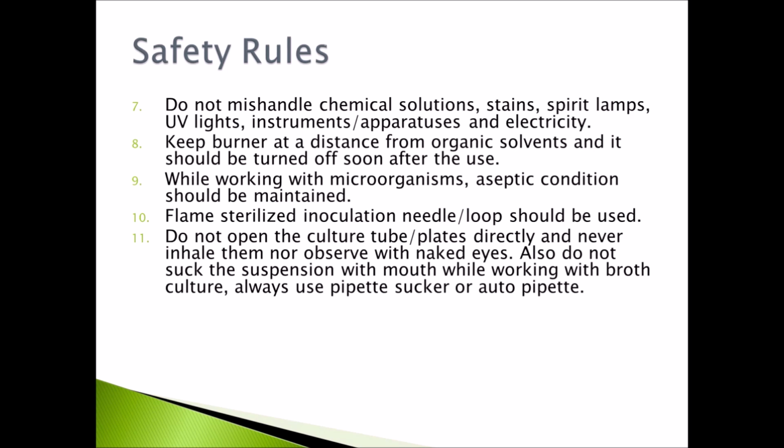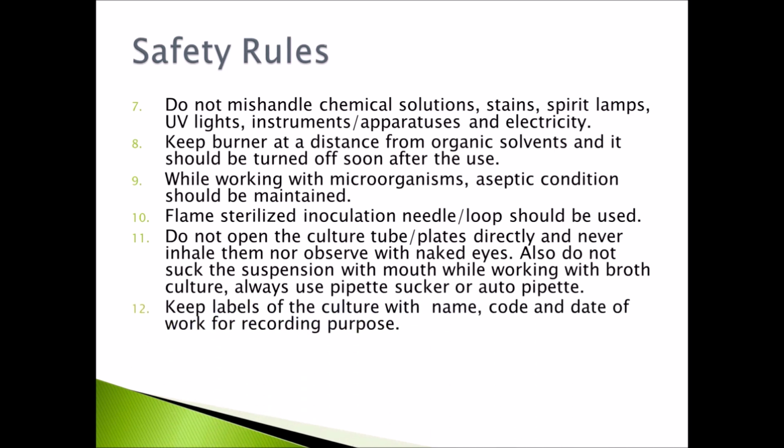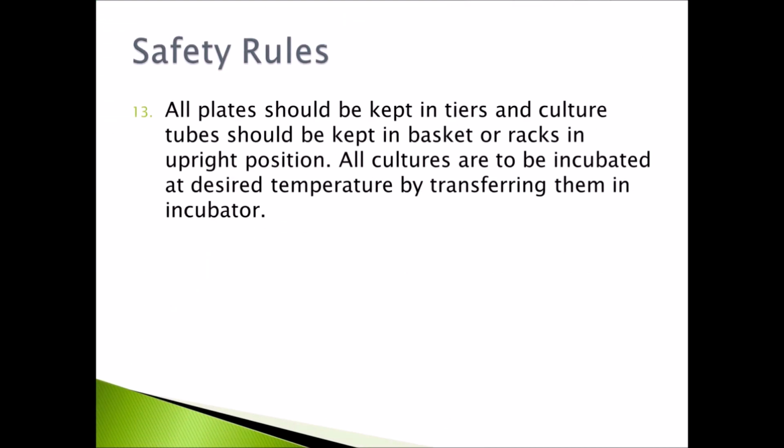Always use a pipette sucker or autopipette. Keep labels on the cultures with name, code, and date of work for recording purposes. All plates should be kept in trays and culture tubes should be kept in baskets or racks in an upright position. All cultures are to be incubated at the desired temperature by transferring them into the incubator.